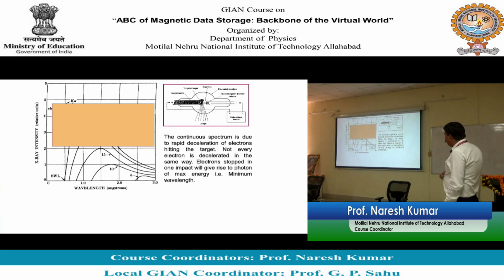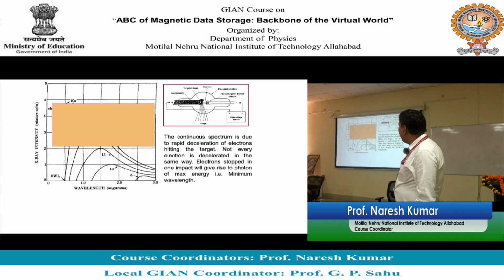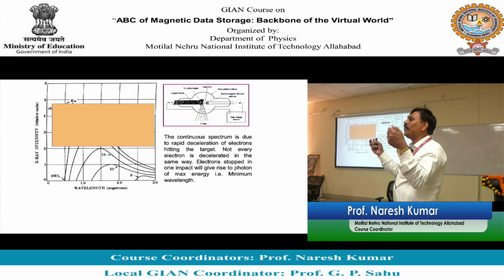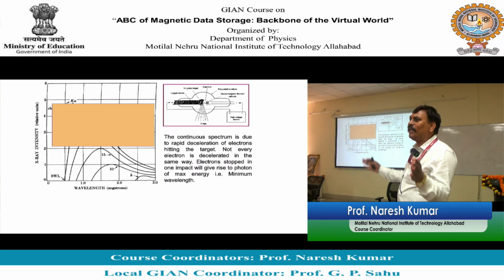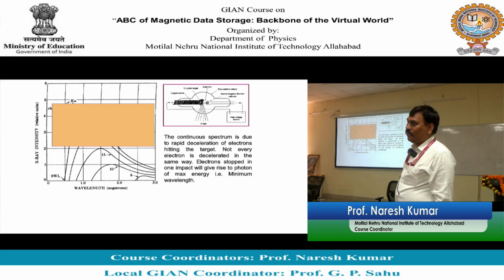So in all these three spectra that I have seen, the wavelength that we are getting is continuous. What is it, sir? I am getting wavelength continuously from one point onwards. Since I am getting continuous wavelength, or all wavelengths, we call this radiation what? Continuous X-rays or white X-rays. White means it has all mixed wavelengths. So this radiation is my what? White X-rays or continuous X-rays.